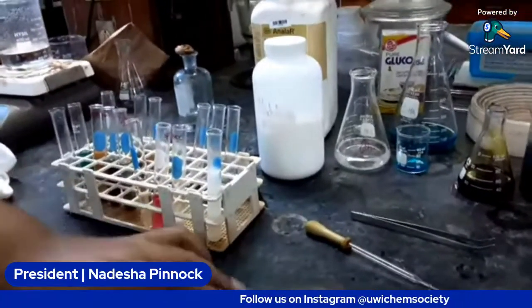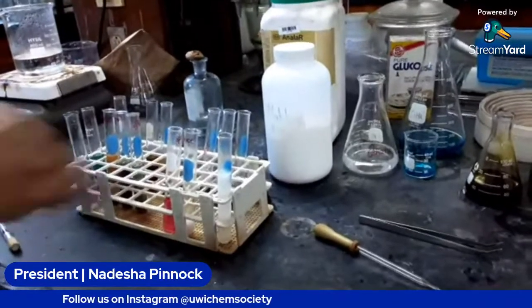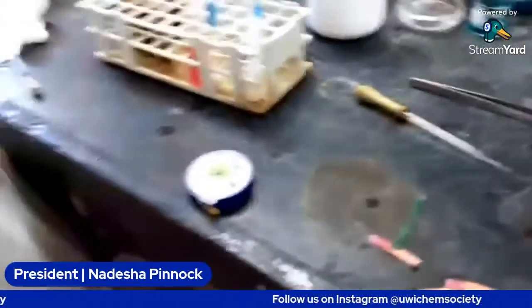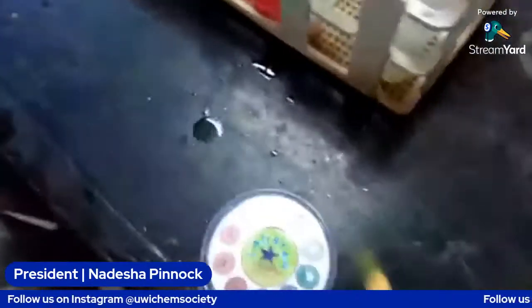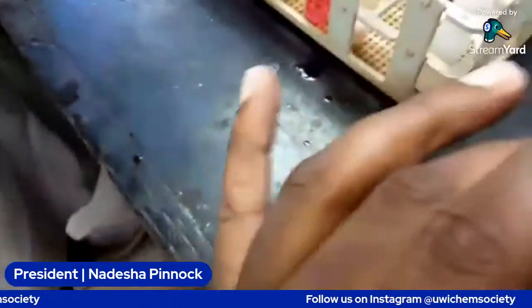Which other test did we do? I think that's it. Yeah, I did emulsion and everything. All right, so we're going to go to questions. Great, we got one of them alkaline. Praise God. Looks like 8.